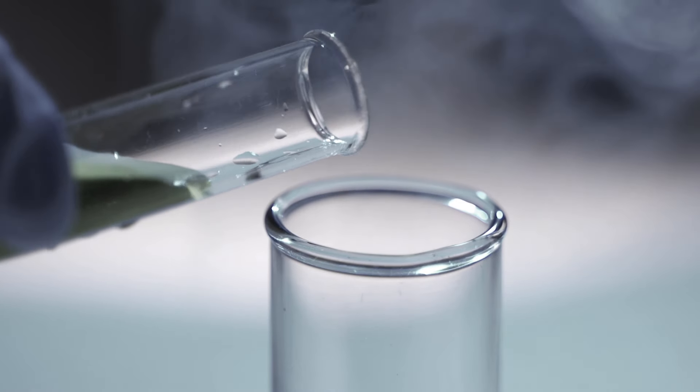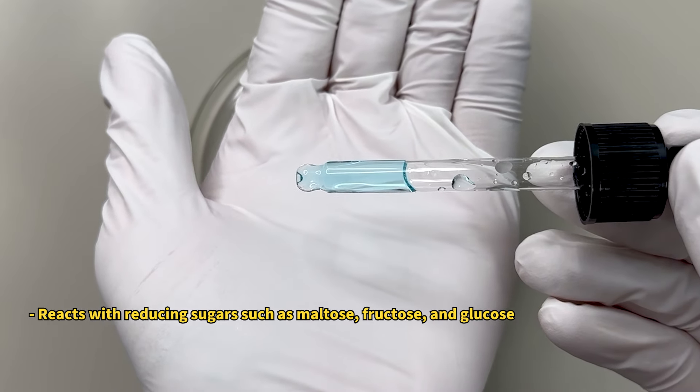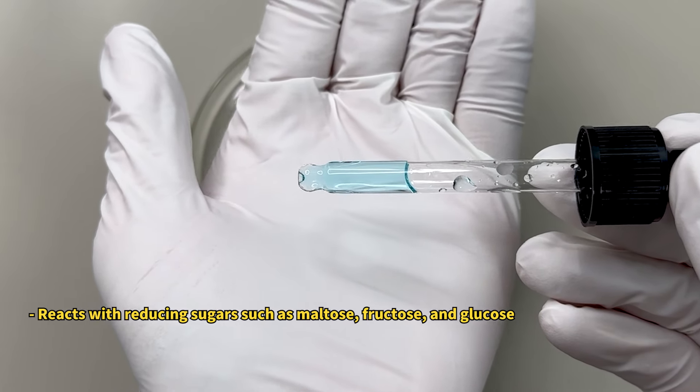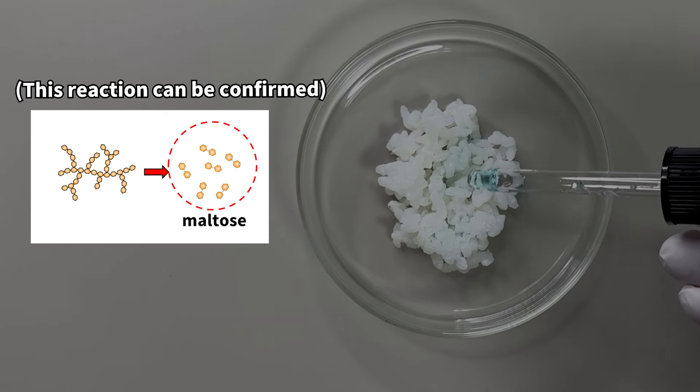For our amylase test, we used Benedict's reagent. Benedict's reagent changes color upon contact with sugars like maltose or glucose, making it ideal for testing for amylase.